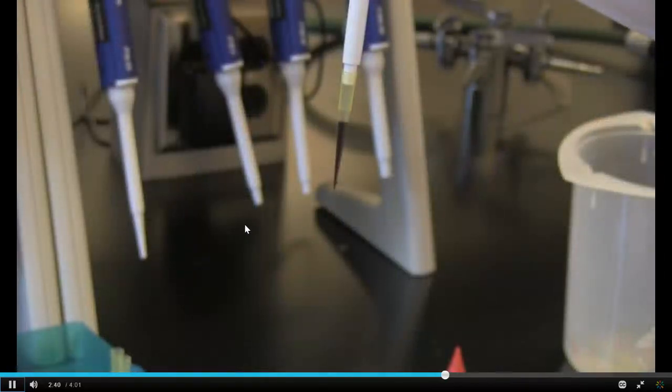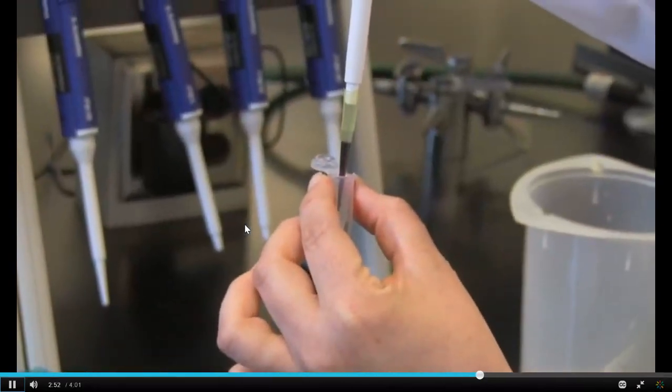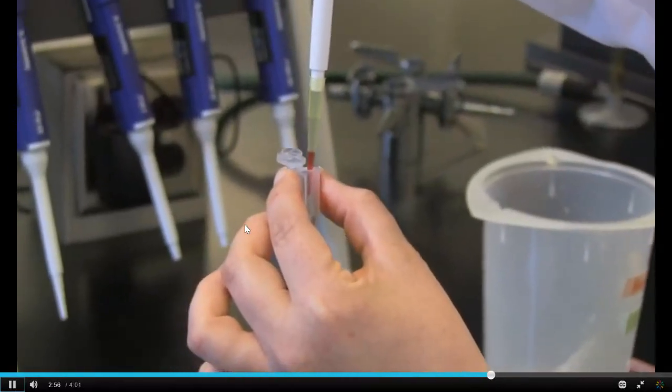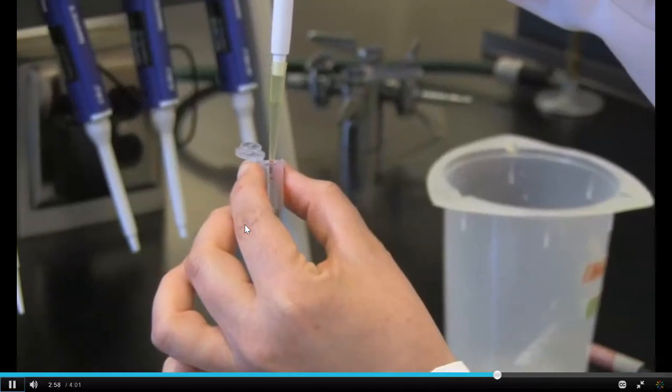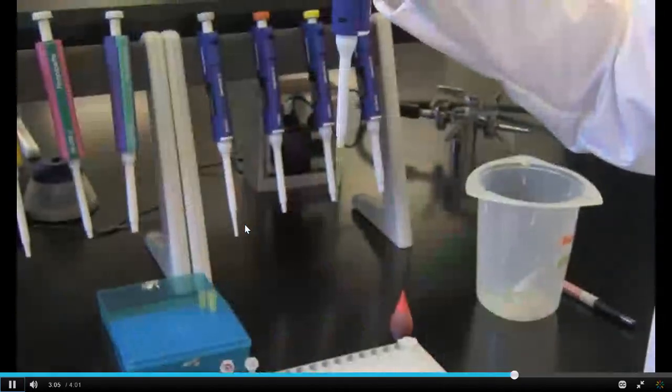Maintain the micropipette's perpendicular position while transferring between tubes to prevent liquid from sloshing onto the micropipette. Once your micropipette is over the second tube, depress the plunger all the way down to the second stop to dispense the liquid. Do this slowly and gently. Keep the plunger depressed until the micropipette has been removed from the 1.5 milliliter tube.